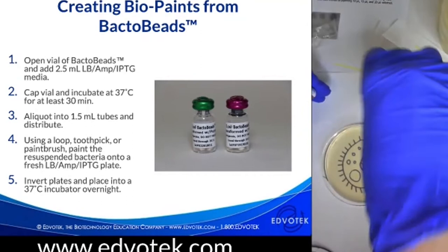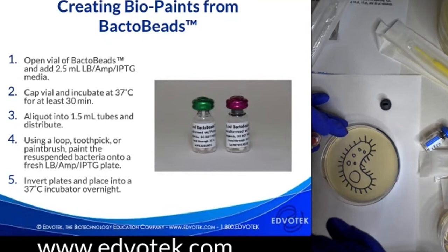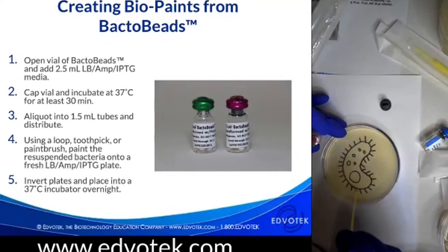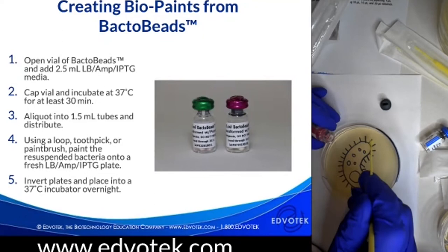So I'm just going to do one color because I rehydrated the one color. And you can take the loop and just start tracing. This is as simple as you can make it, for those who are nervous or apprehensive about getting involved. And again, there's four colors, so you can explore with those colors, see what would happen if you had combinations of those colors. Do you get mixes? Do you get individual colonies?